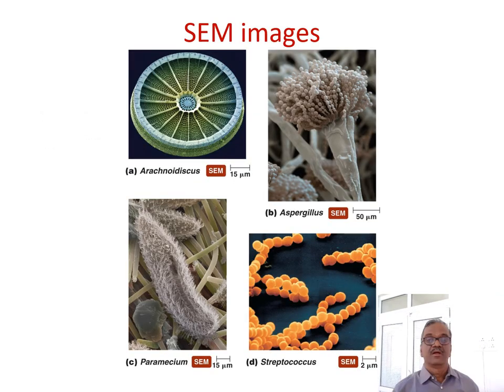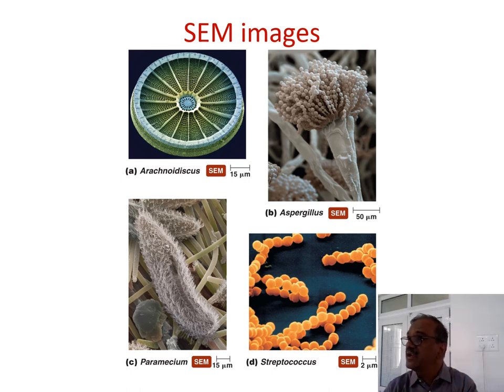Same image, just observe. These are very small organisms, but you can see how brilliantly they capture various stages of the fungus Aspergillus, or Paramecium, or Streptococcus bacteria. Everything, the same images. This is on the surface, but if you want to see the inner details, you have to go for TEM.